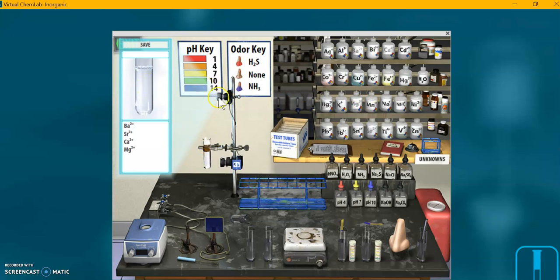And you can see right here, this is where the test tube is. But on the expanded close-up view, it tells you what exactly we've got in our test tube.